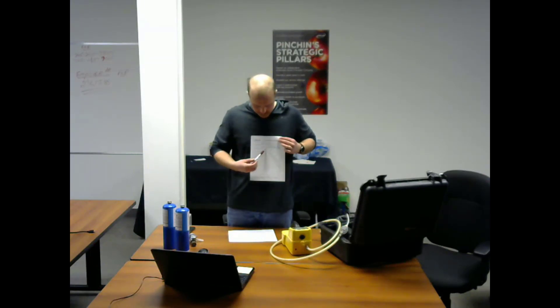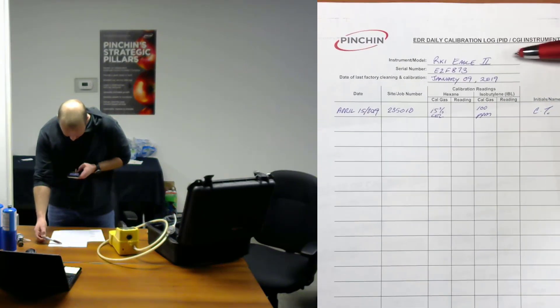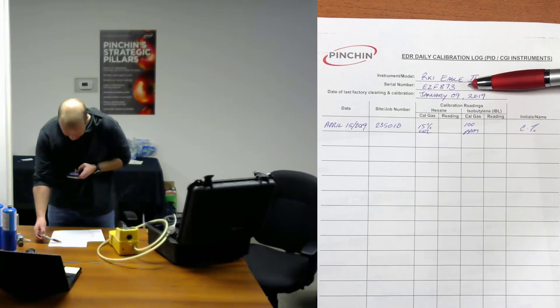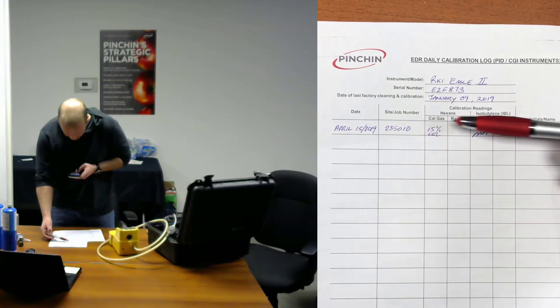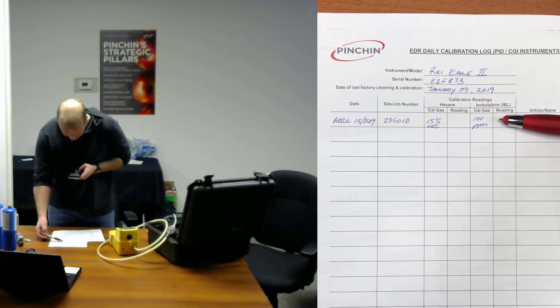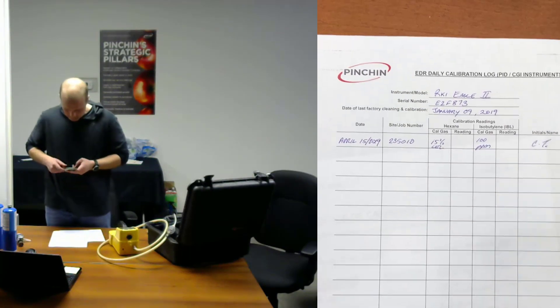Next, prepare your field form by recording the instrument information, date of calibration, and the concentration of the calibration gases that you're using. Here's a copy of the form with the instrument model, the serial number, the date of its last cleaning calibration done by Maxim, the date that we're doing the calibration check, the job number, the calibration gas for hexane which is 15% LEL, the calibration gas for isobutylene which is 100 parts per million, and my initials.